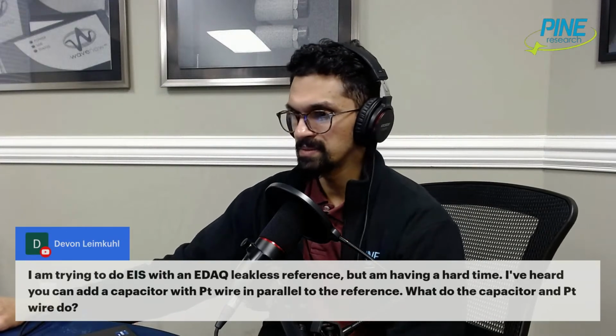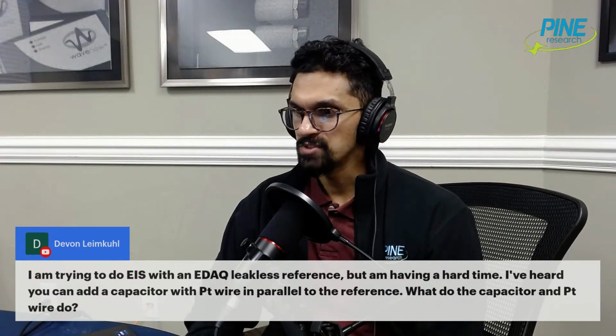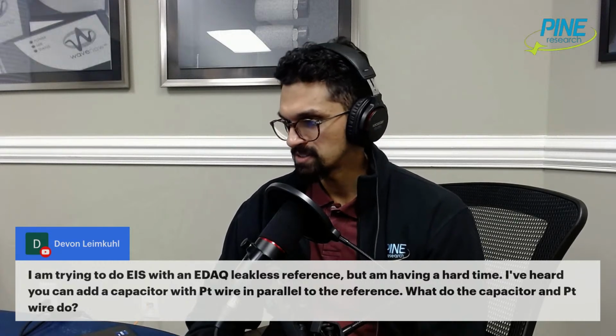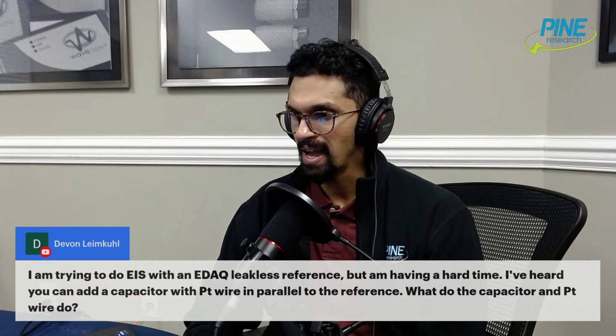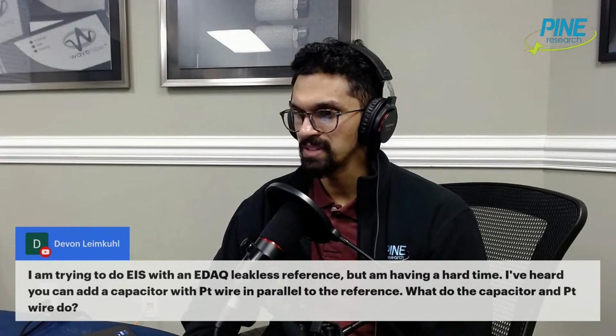Okay, let's go to the next one. Devon is asking, I'm trying to do EIS with an EDAQ leakless reference, but I'm having a hard time. I've heard you add a capacitor with a platinum wire in parallel to the reference. What do the capacitor and platinum wire do?